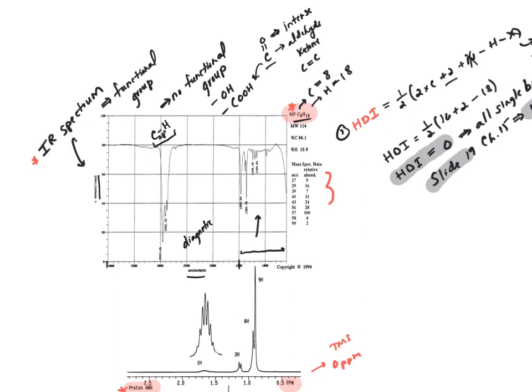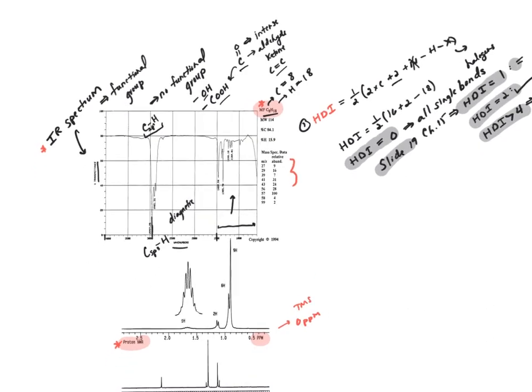Right, so for this one, there is no oxygen, so there are none of these guys. There is no double bond, so nothing here. And we will find at about 2900 a peak that's due to, again, those carbon-hydrogen bonds to sp3 hybridized carbon, right? And so that's not going to help us do anything. It's not going to tell us anything about this compound, okay? So for this IR spectrum, there's not much to do. So we move on, okay?